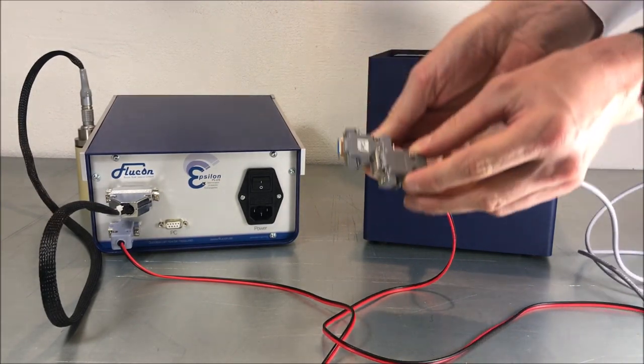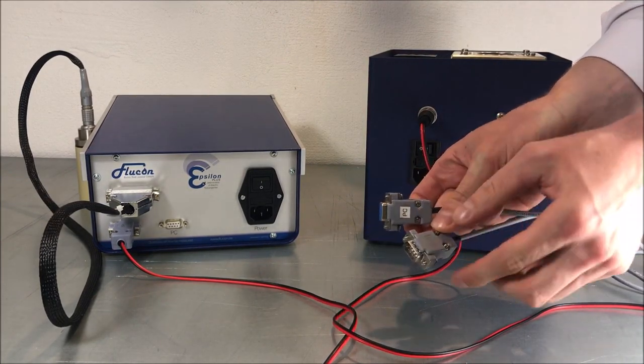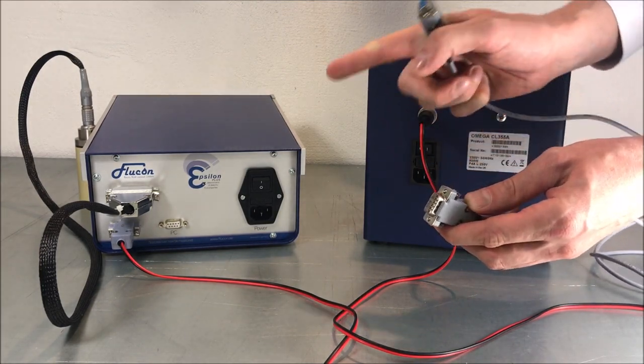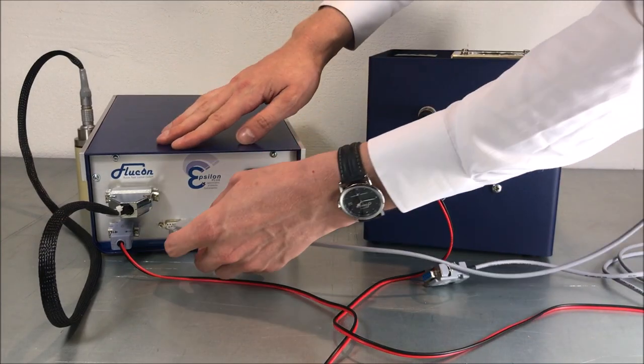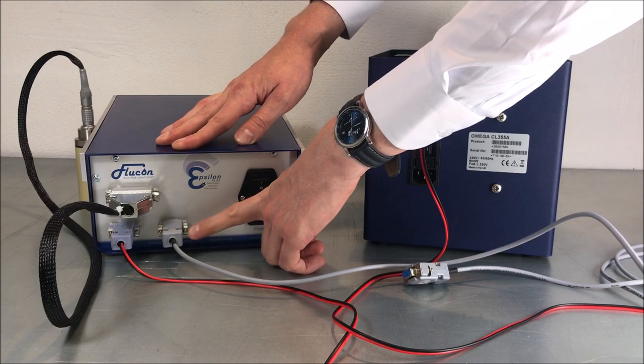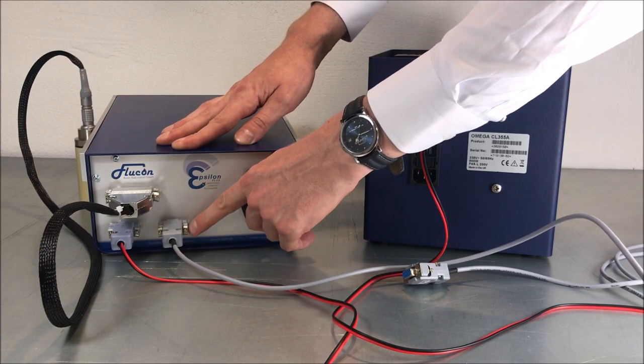Next up, take the data cable with the PC sticker on it which marks the computer side. So this is the plug that goes into your Epsilon Plus device. Once again, use the two screws to fasten the connection.